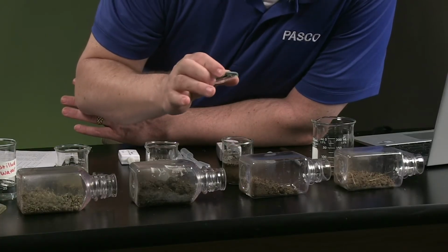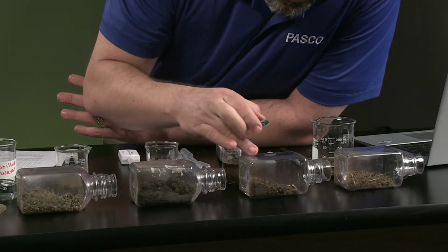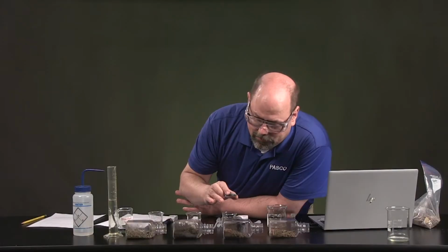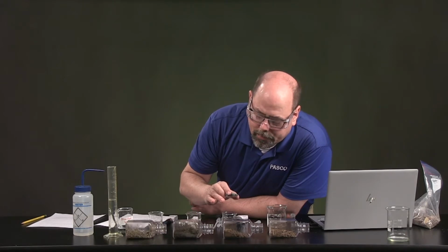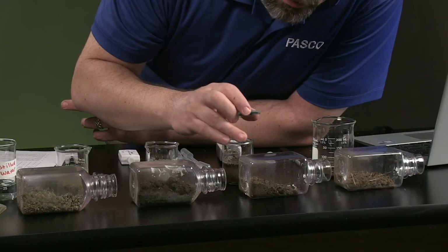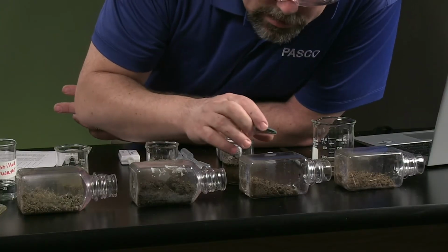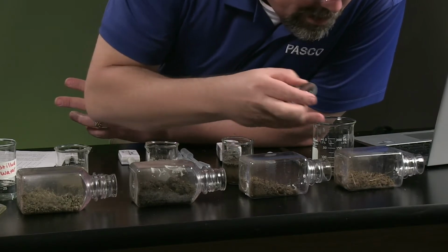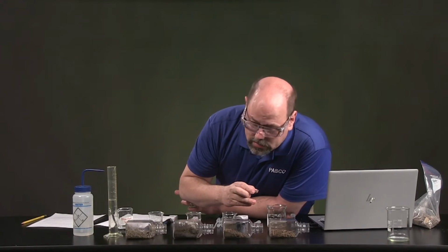Now, the next one that we're going to go to on here, and I'll label each of these before we finish so we don't forget which is which. This one came from underneath some of the pine trees that are here, and so it had a leafy sort of litter, the light pine needle litter. It's much finer soil, I would say, as I'm taking a look at those. I do see a little bit of sand in there, or grit, that I don't see in the grasslands.